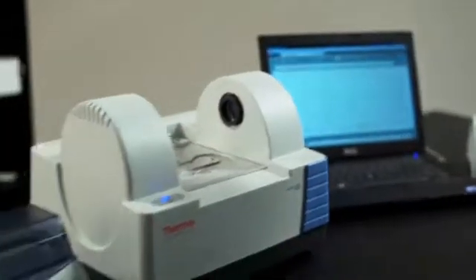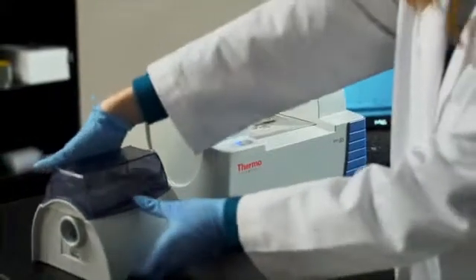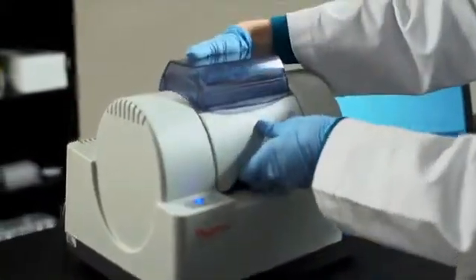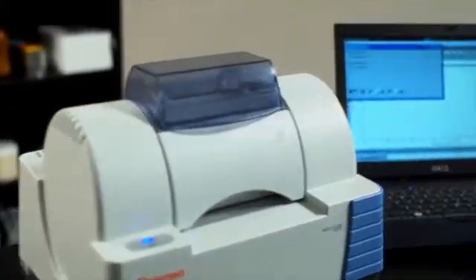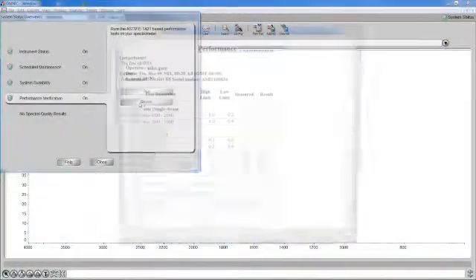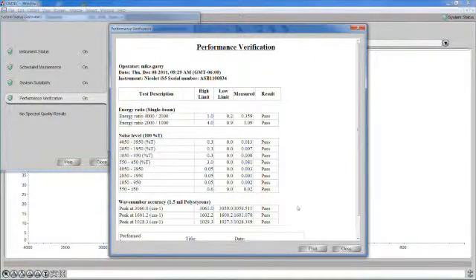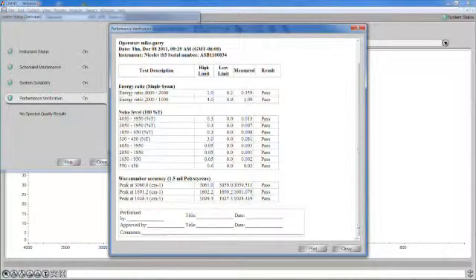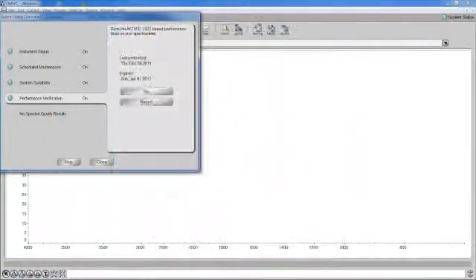Just insert the appropriate sampling accessory. The Nicolet IS-5 instantly recognizes it and automatically configures OMNIC software for analysis. And our exclusive built-in system performance verification assures that measurements are accurate and reliable, sample after sample, and test after test.